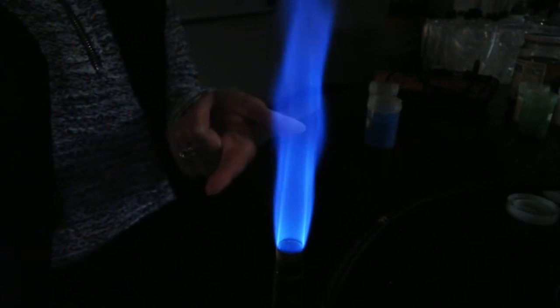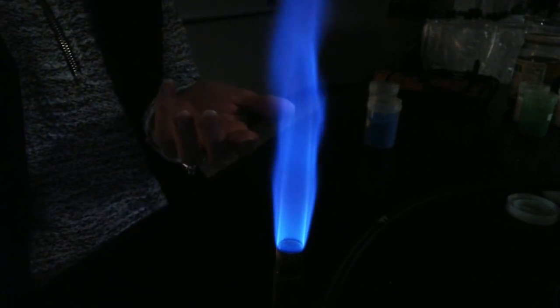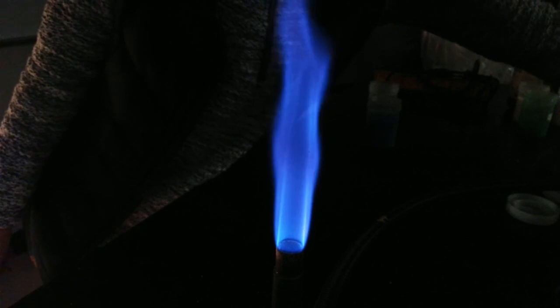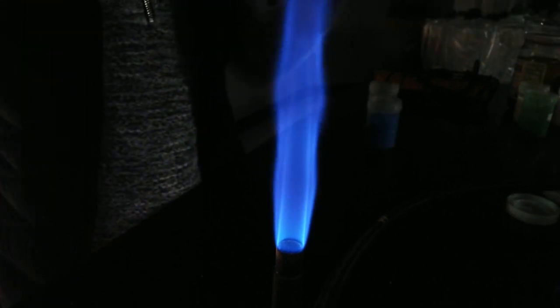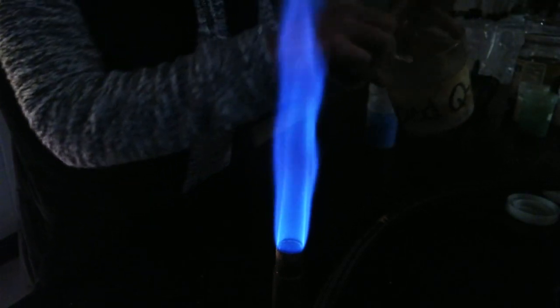They were all chlorides. But if the flame test represented the color of the chlorine, then wouldn't they have all been the same color? And obviously they were different. So this flame test method is great for getting the energy level and the transitions of metals. And so it really gives you the color of the metal, not the chlorine.